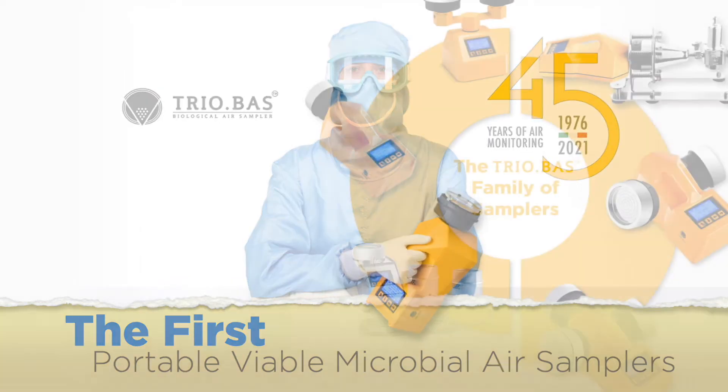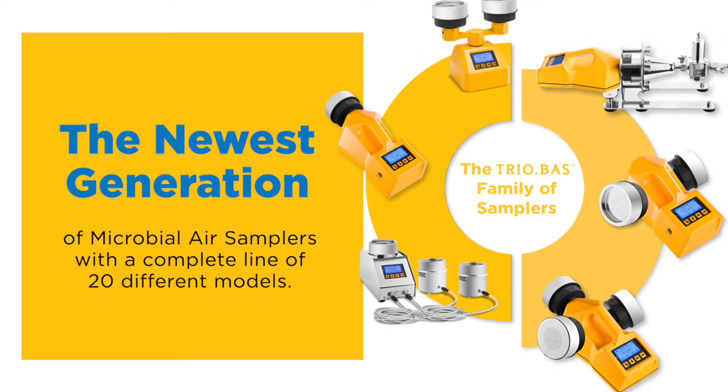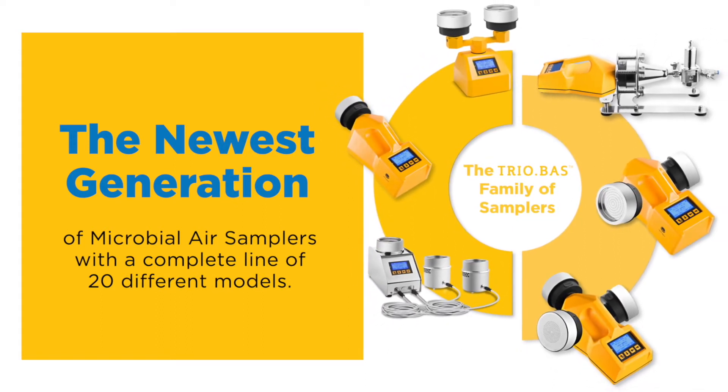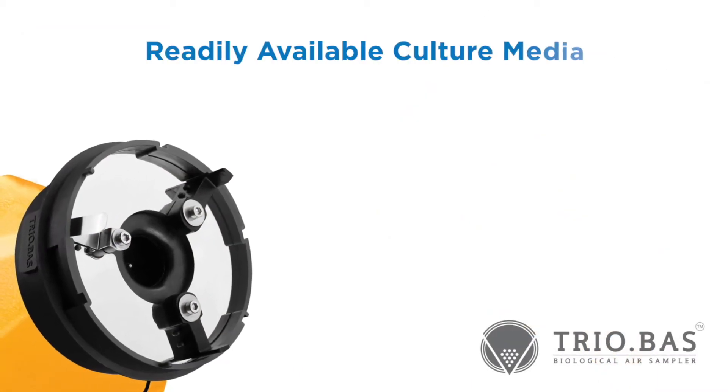Triobos instruments represent the newest generation of microbial air samplers, with a complete line of 20 different models. All Triobos instruments use readily available culture media.